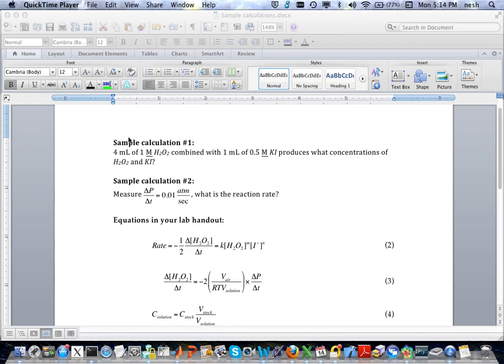Making this video to help you through some of your sample calculations having to do with the first lab of the semester, the decomposition of hydrogen peroxide. So let's just get right started. I'm going to recommend that you launch Excel if you want to follow through and enter in calculations as we're going along, because that's how I'm going to be doing them here.